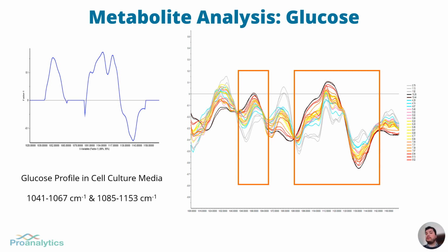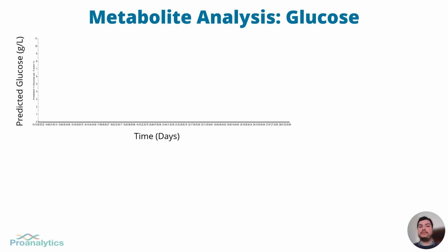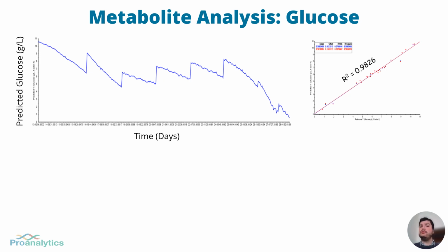You can see the two bands with the original orange within the orange rectangles on the graphic. Looking at the data over several days, you can see the glucose levels decrease and increase, hence the sawtooth design of the curve. You are looking at pumps turning on over the run with sharp spikes of glucose additions. Some people refer to these events as bolus feeds.